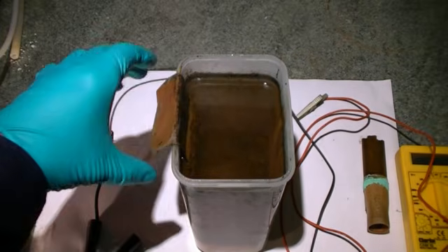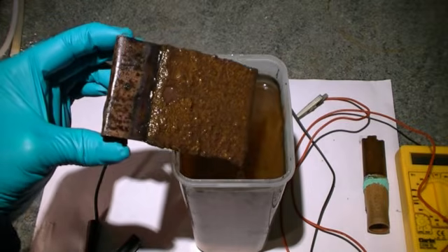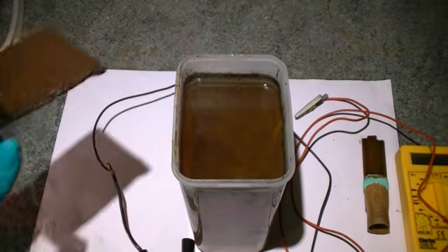On removing the copper cathode, with the exception of some of the reactive products from the copper anode deposited on the surface, it doesn't appear to have reacted in this setup.